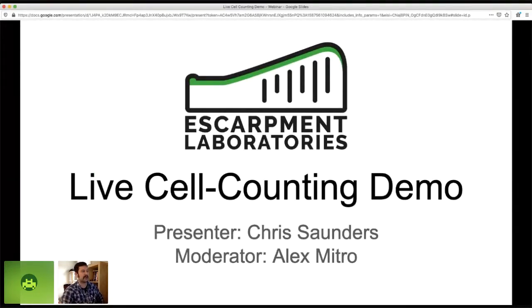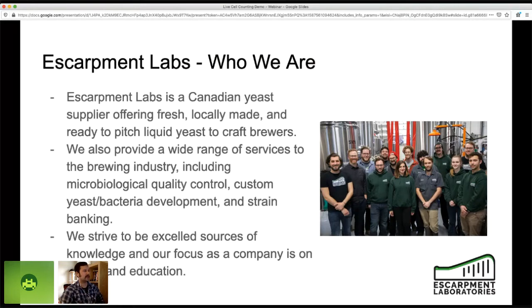Okay, so this is gonna be a live cell counting demo. I'm also gonna be covering, I guess, theory and the practical aspects of doing cell counting. And as mentioned, I'm Chris, and Alex is our moderator. So who we are, that was kind of discussed already.